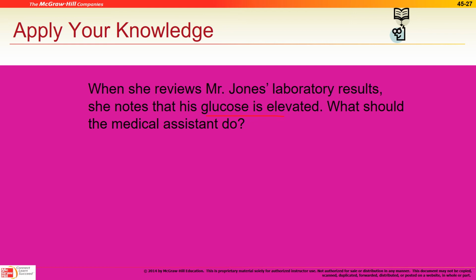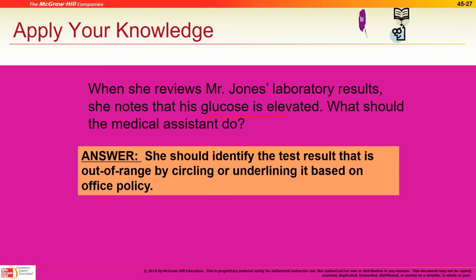Tell Mr. Jones that the doctor will inform him of the results. So for the MA, whatever you use to flag it, here they circle it for this facility, that's so the doctor can see it real quickly.